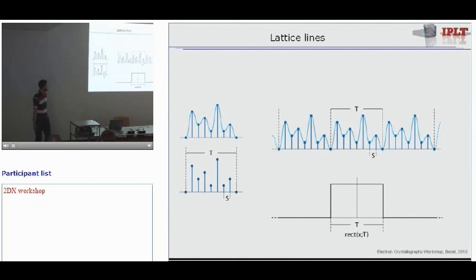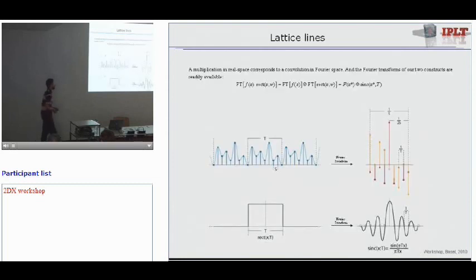So that's basically a sample you have in real space, which has a certain thickness and a certain sampling. Now what we imagine is that conceptually we say, okay, let's do the same thing that you would have if you had a 3D crystal. So you basically repeat it in the Z dimension, and then we multiply it by a rectangular function to get really a sample which has, in the end, some information here, and it's 0 outside of that. So in real space, you would multiply these two.